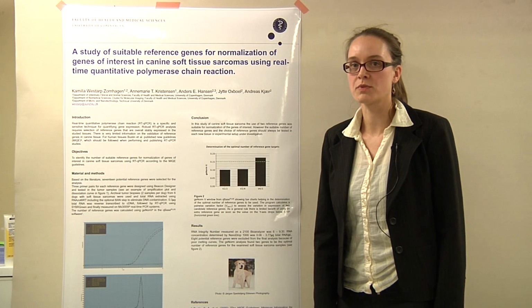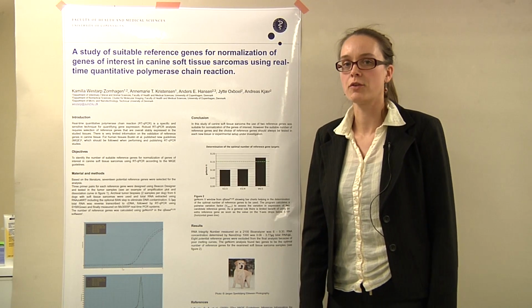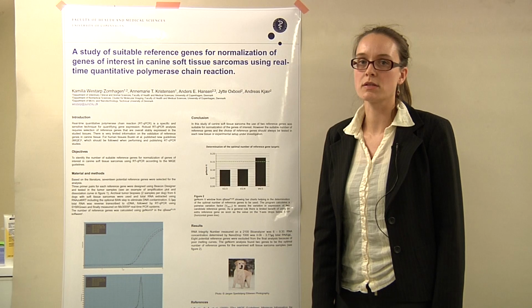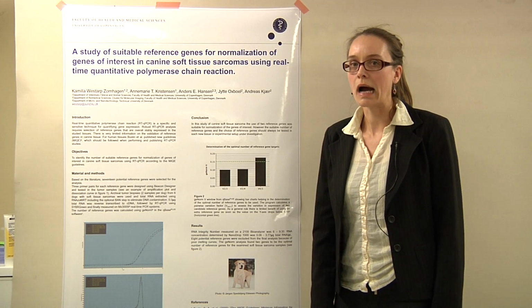The work that I want to present for you today on this poster is a study of suitable reference genes for normalization of genes of interest in canine soft tissue sarcomas using real-time quantitative polymerase chain reaction, RT-qPCR.